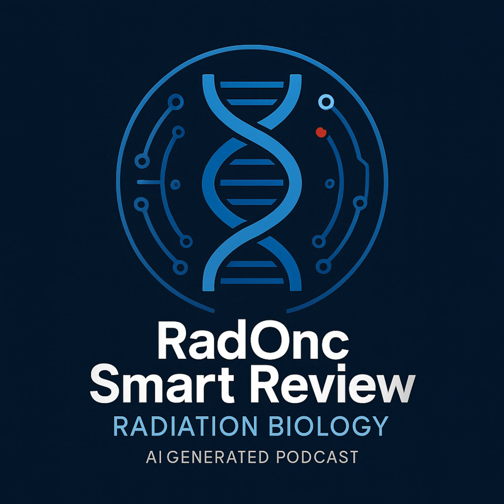You embed single cells in a thin layer of agarose gel on a slide. Then you lyse the cells using detergents and high salt to remove membranes and most proteins, leaving behind the DNA packed in its basic structure, the nucleoid. Then you apply an electric current, electrophoresis. The intact DNA mostly stays put in the head of the comet, while the damaged DNA streams out. Exactly. The broken fragments and relaxed loops get pulled towards the positive electrode, forming the tail.